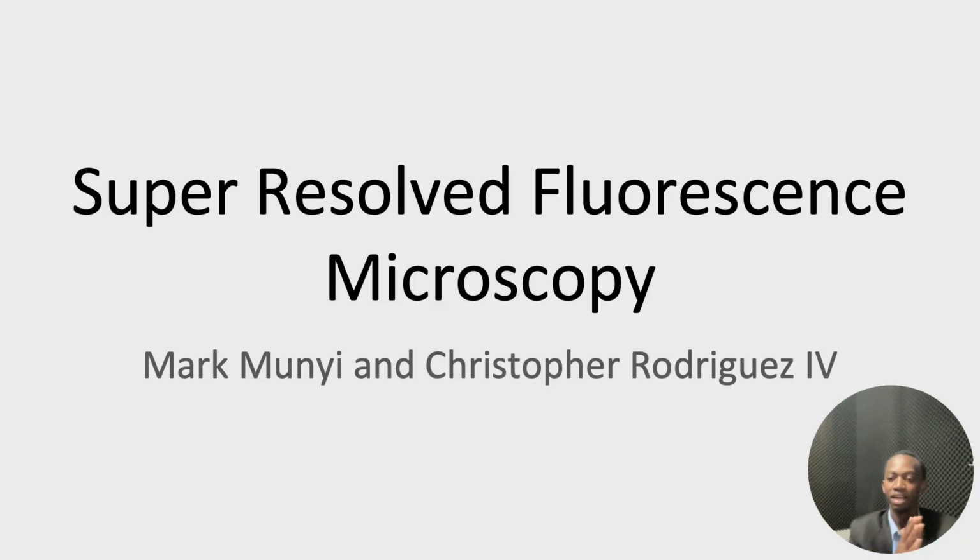Hello guys, my name is Mark Munyi and Chris and I will be presenting about super resolved fluorescence microscopy. This is a topic that won the 2014 Nobel Prize in Chemistry, where three gentlemen, Eric Betzig, Stefan Hell and William Moerner, were awarded for contribution and advancement in super resolved fluorescence microscopy.